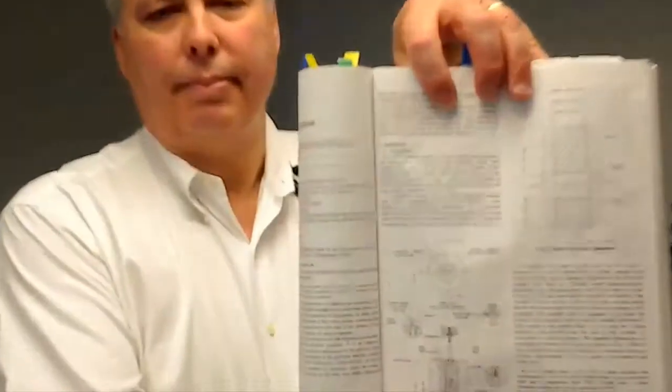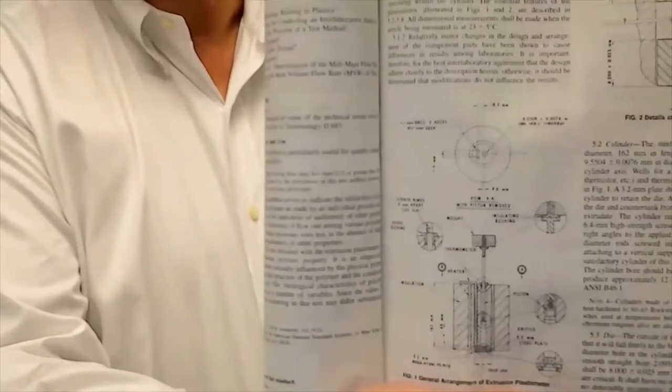This is a schematic of the actual test methods here.